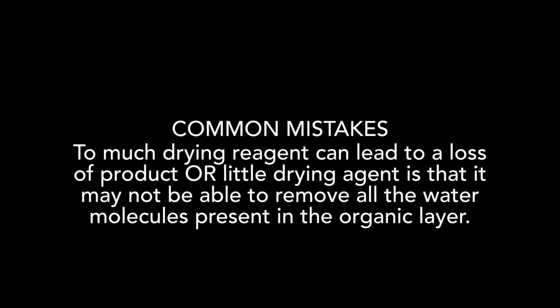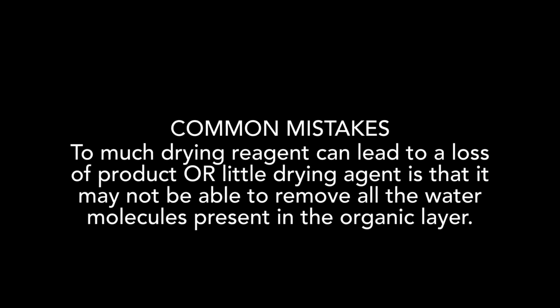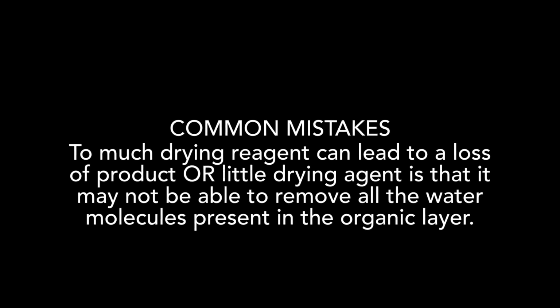Now again, drying reagents are only used to remove the traces of water. Another important note to keep in mind is that within an experiment, you are not going to be given an exact amount of magnesium sulfate to use.